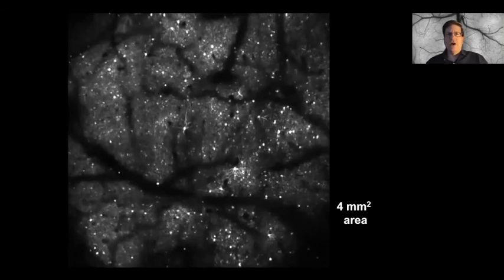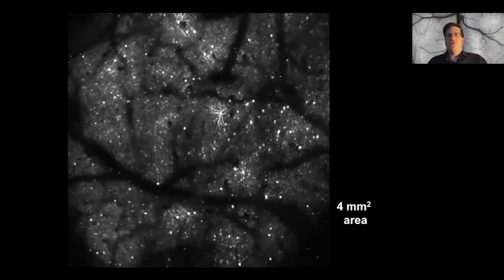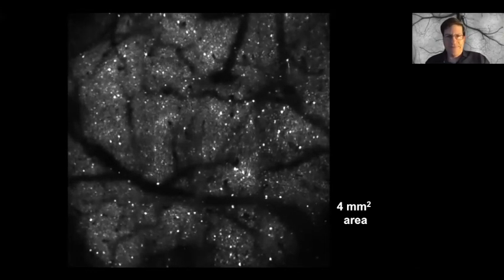Here's another example from another mouse. And in this mouse, you can see not only the somatic patterns of activation here in the cell bodies, but also you can see dendritic patterns of activation. And in this movie, we had improved our computational stitching of the different tiles, and they're probably harder for you to notice.